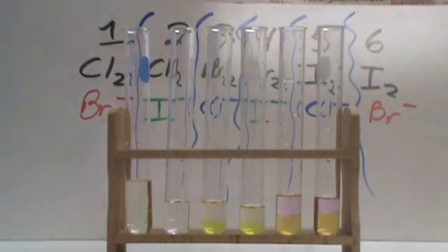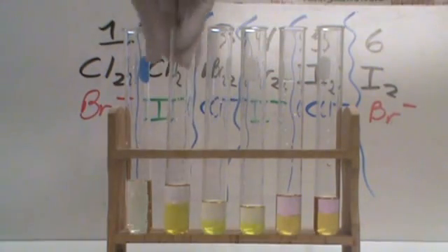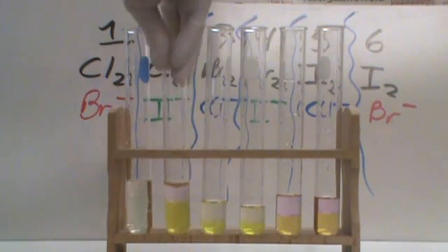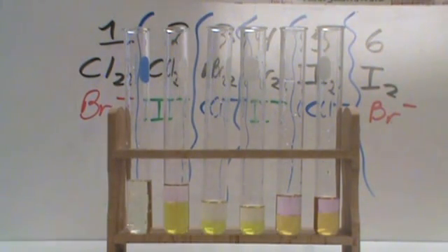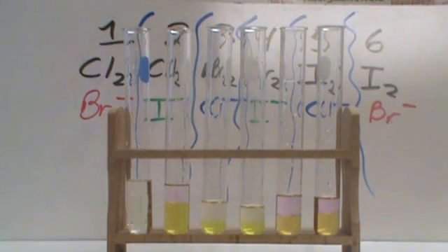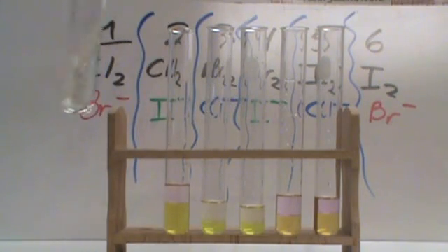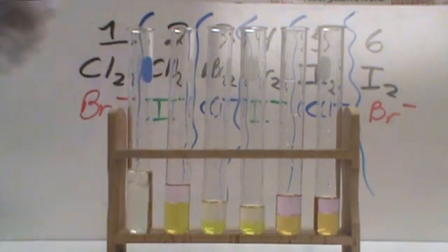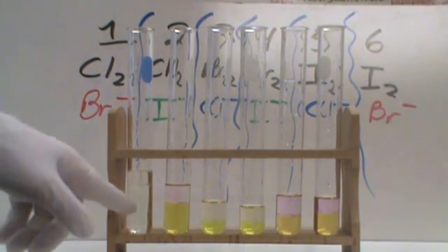In the second one, we're going to put some iodide. Likewise, it's no longer clear. We can now see a color change. What's happening is I'm forming iodine and chloride. We can see there's a similarity now between this one and these ones because I've now formed iodine. There's a similarity between this one and these ones, although it doesn't look particularly strong. Let me add a little more and get that color to pop a little better. So not great, but the color is different now than the clear.